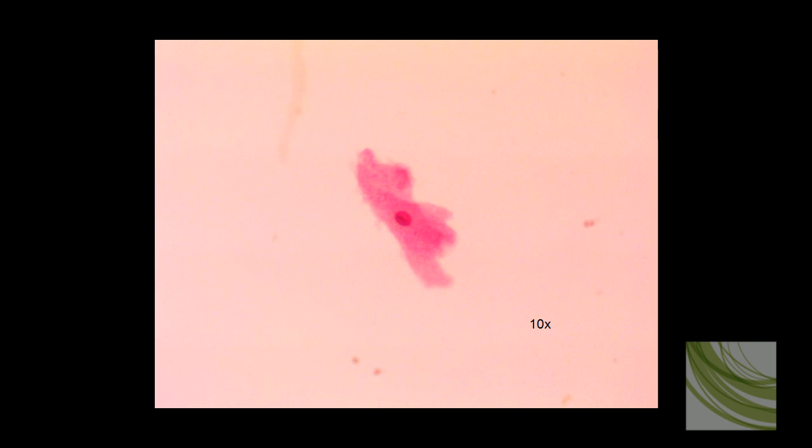We've got several amoeba that are very obvious here. They've been stained, we can actually even see nucleus. We're using the 4x objective here.